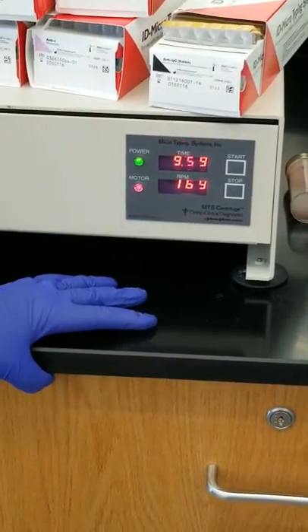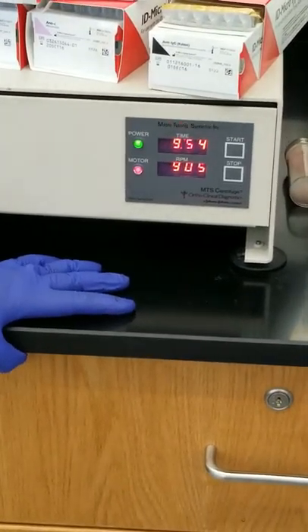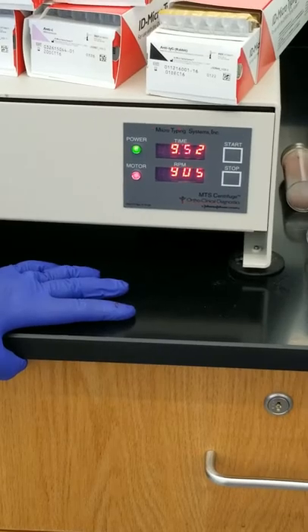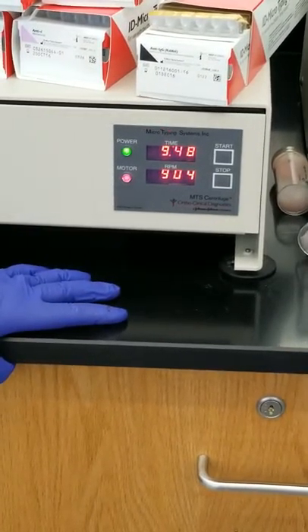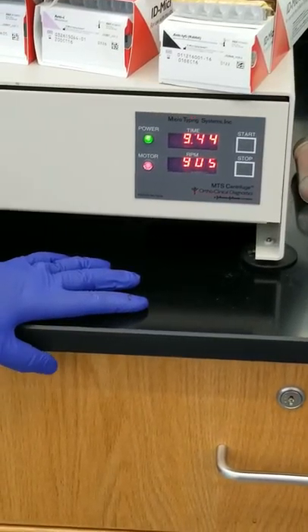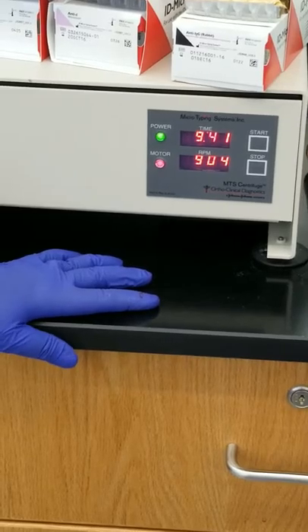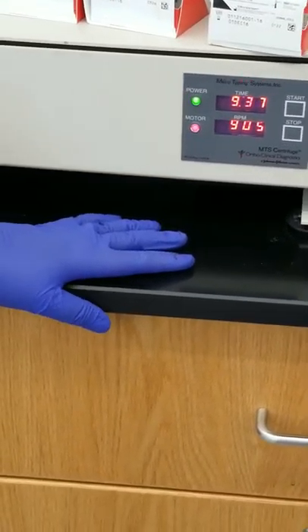Okay, it's preset to 10 minutes. The RPMs should be somewhere between 870 and 920. If they're not, there's no way that you can really adjust it. The only way you can fix that is to have somebody come in and actually take the thing apart and try to adjust the RPMs. So really and truly, the RPMs should work fine.